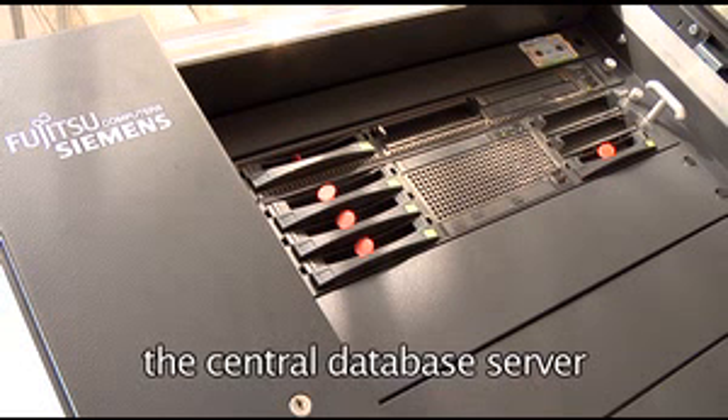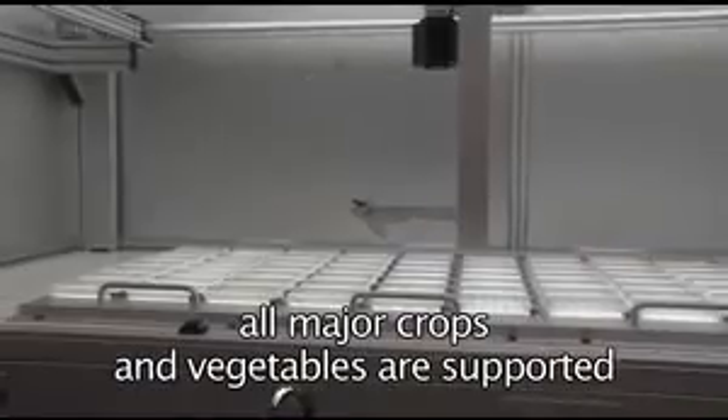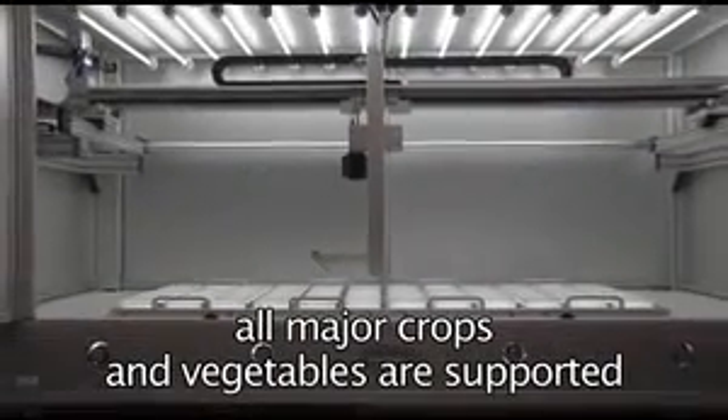High-performance Siemens server technology provides state-of-the-art data technology with more than 40 terabyte data handling capacity. Lemnatec Scanalyzer HTS systems are used for all major crops and vegetables to provide reliable, high-content phenotyping data.